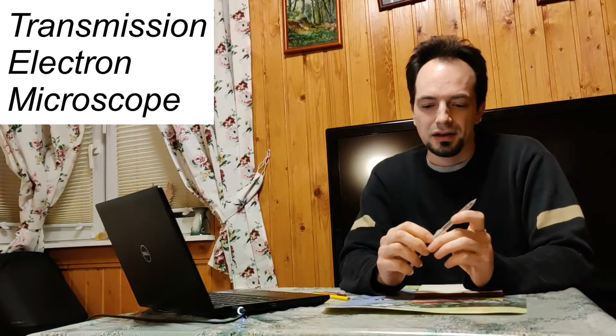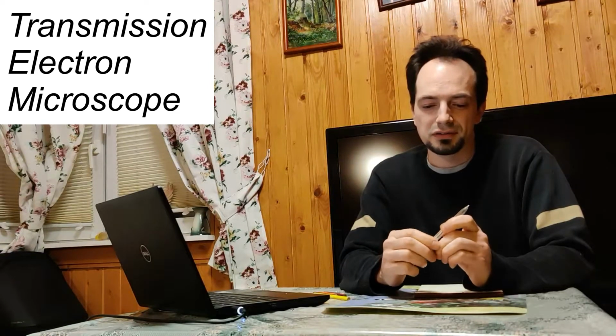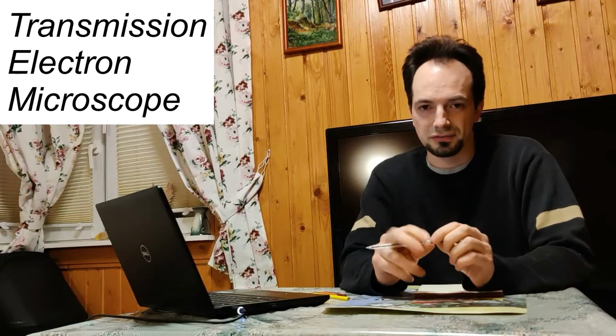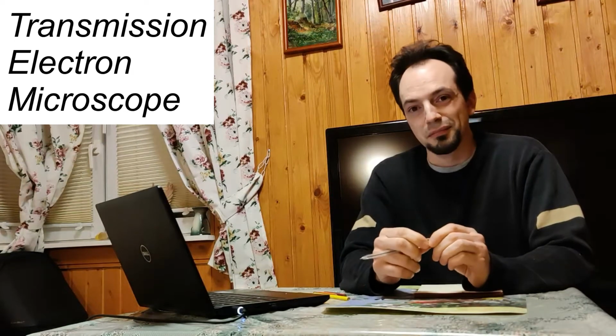Historically, the first electron microscope to be developed was the transmission electron microscope, or TEM. The principle of operation of TEM is quite simple, but we won't discuss it in detail for now, because in my opinion, scanning electron microscopes are more widely used. They give more informative results in terms of images, and their images are easier to interpret.